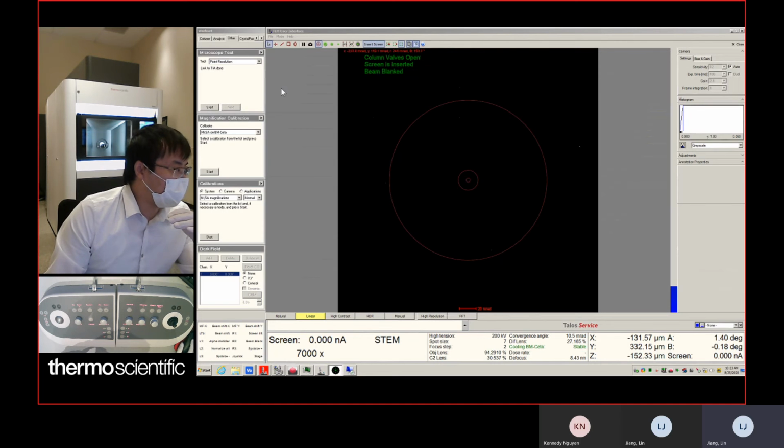You just follow that. And the magnification calibration is where you calibrate your diffraction by using the cross grating gold sample, and calibrate the high HR STEM on the STEM imaging by using the silicon 100 sample.